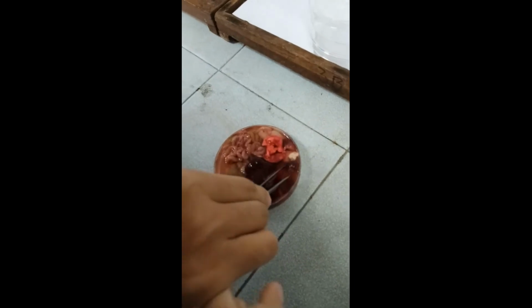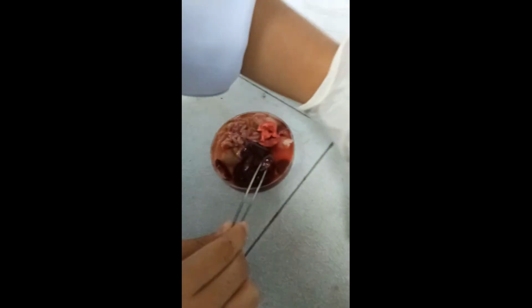After we rinse it with NaCl, we are going to put it into the container filled with formalin, according to the label. Okay, bye-bye kidney.